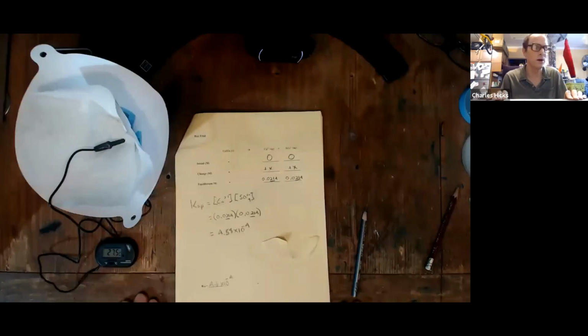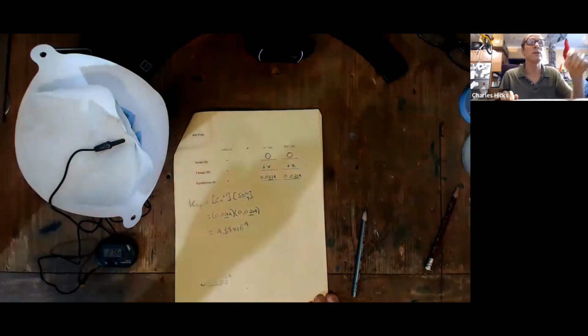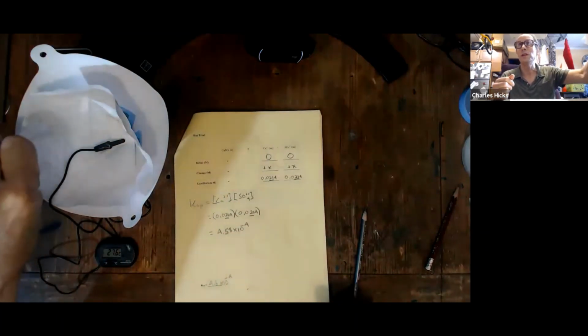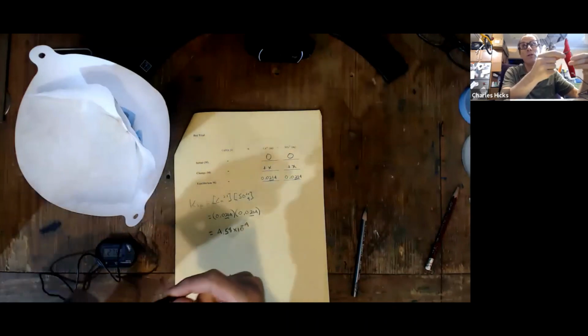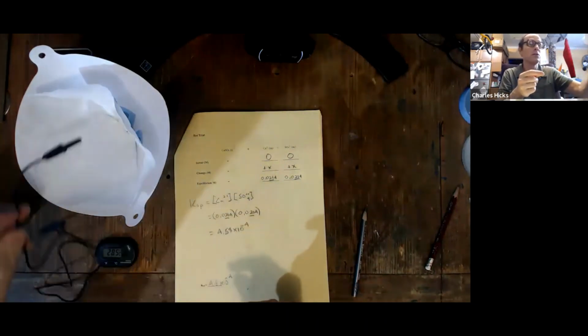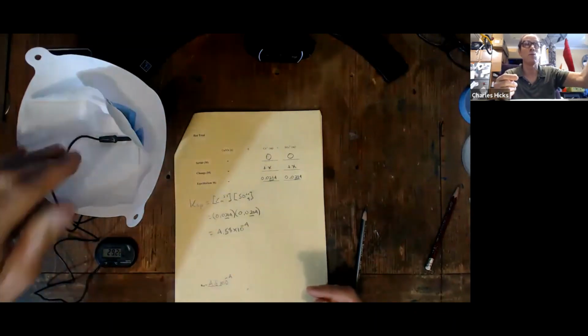One little follow-up note, in the experimental procedure for this experiment, it tells you, when you're measuring the temperature here, to measure two temperatures. The temperature when you first pour the solution, and then when the solution is almost fully drained, and it says when the temperature probe is just fully immersed. When I was performing the procedure on camera, I found that was impractical. I think the best we could do is record a single temperature, which is the temperature that we observe while the solution is draining. So that's the way I perform the experiment, and that is how I suggest that you perform it yourself.